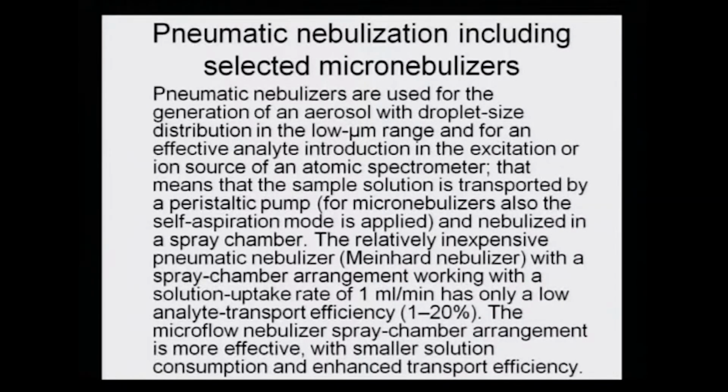So, why was there a need for a pneumatic nebulizer? The need came into being because very small droplets and aerosol had to be prepared for sample introduction, down to the micrometer range, and for that the pneumatic nebulizer was the only answer.